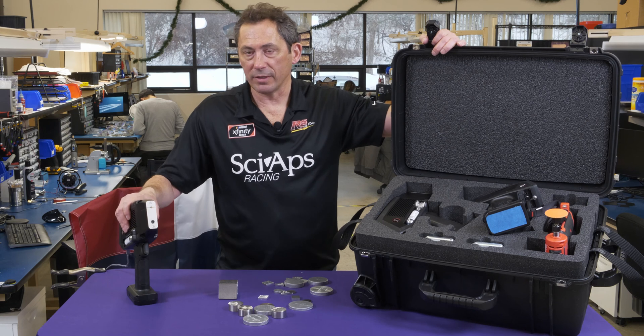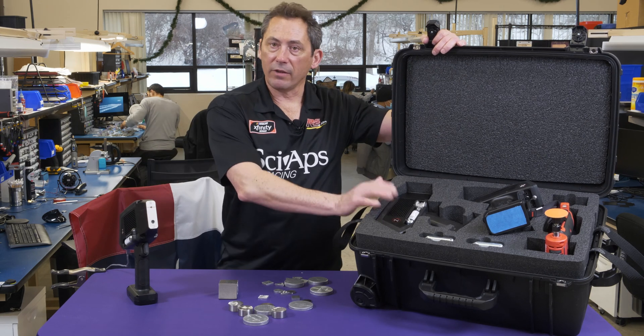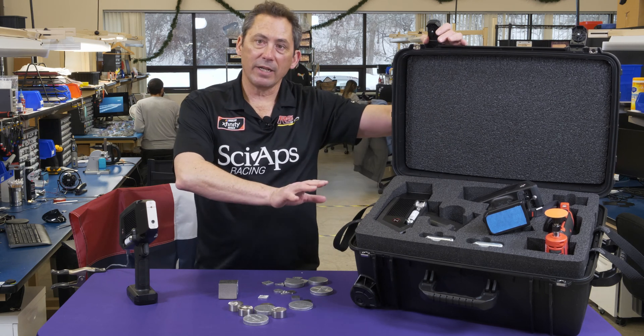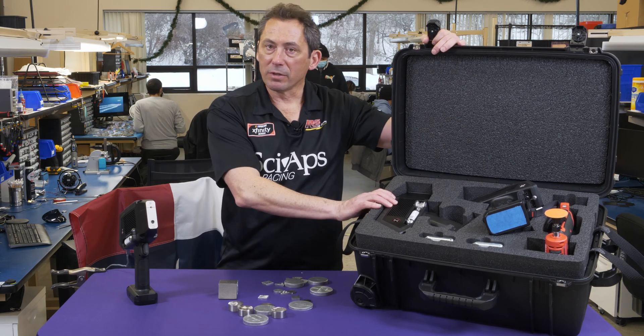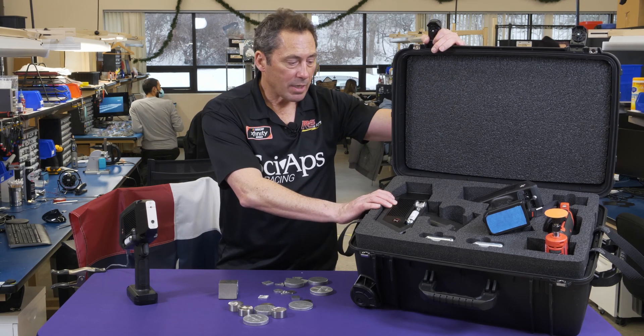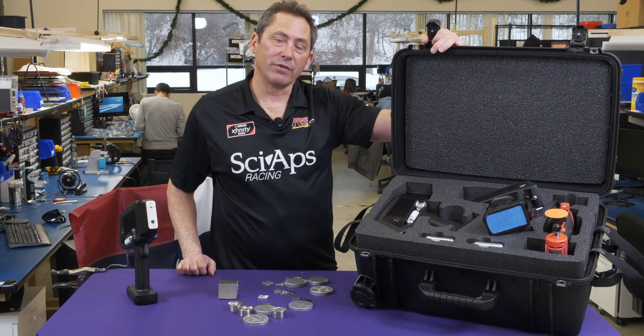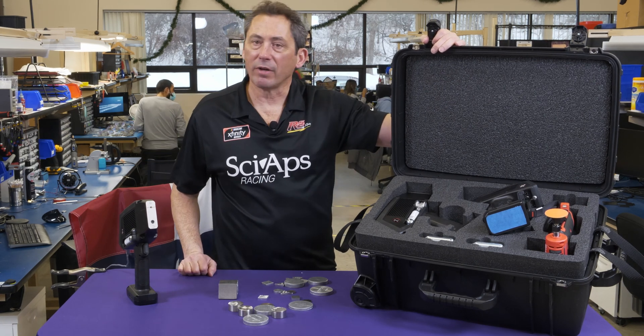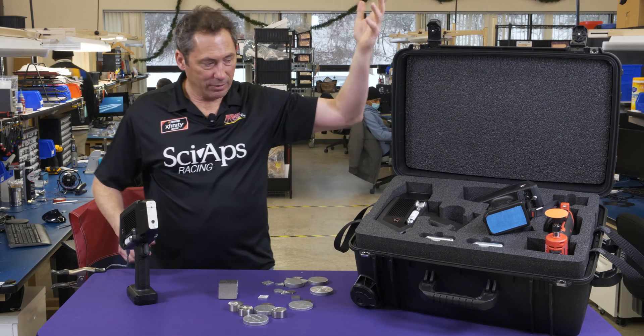Or carbon and silicon. So they pair that with the XRF. Why? Because they can use the XRF for what it's great at, and they can use the LIBS for what it's great at — which is carbon and silicon alongside your other elements. You put it together, and that's the one-box package. It gives you the ideal technology for each set of elements you're trying to measure.